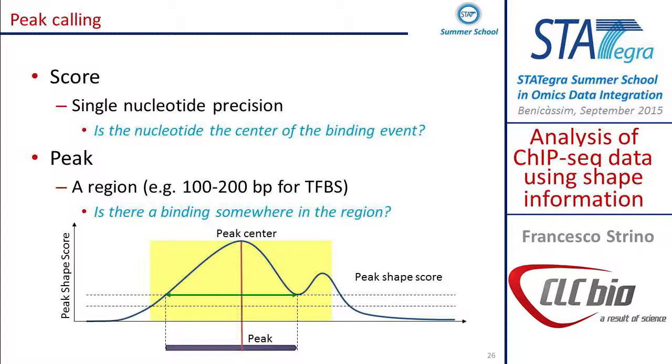And the next thing that you may want to do is, once you have a score, how do we get a peak? So the way to go, or at least the way that we use, is to start from the center, and then we just expand left, expand right, and then basically we go all the way here, and then we say from this level how far do we go on this other side, and then basically we stop here because this one starts going up again.